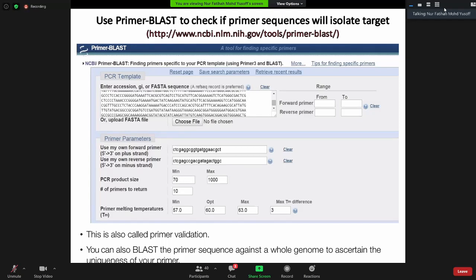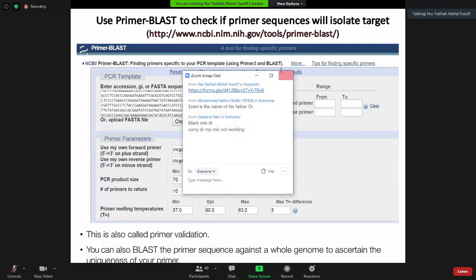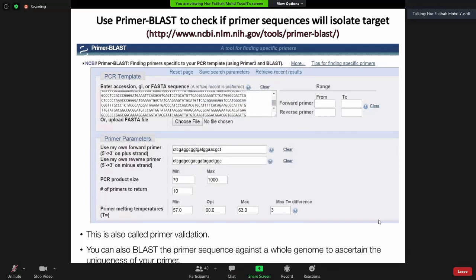When you want to do the amplification of the gene, your template comes from a collection of genes or a collection of transcripts. Because in genomic DNA, there are many genes, as I showed you before. They could be thousands.